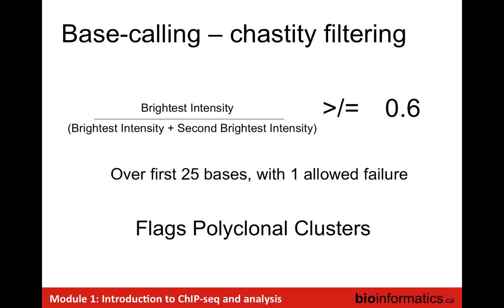So you'll see the chastity filter is actually encoded within the read name of your FASTQ file, right? Is that applicable to DNA methylation as well? It's applicable to all sequencing, yeah. And if it's a good sequencing run, you should have very few polyclonal clusters, very few chastity failed, but it's a good check, right? You can grep through your file pretty quick and see how many chastity failed reads you have, right? That's always a good thing to do.